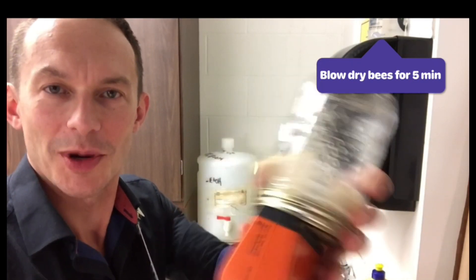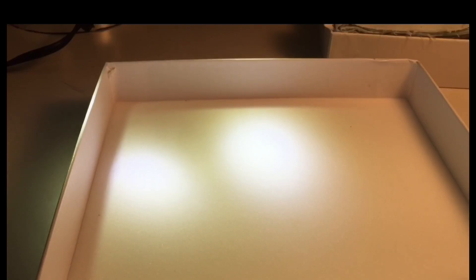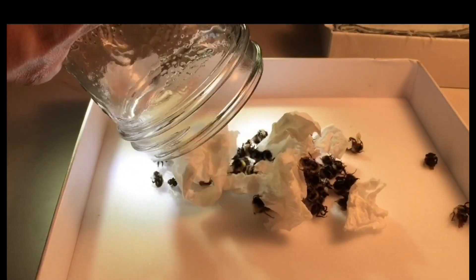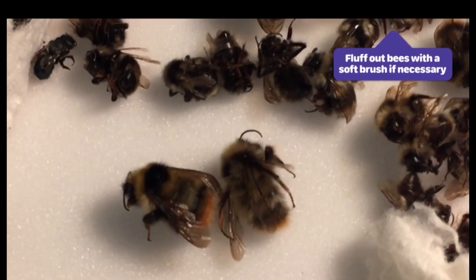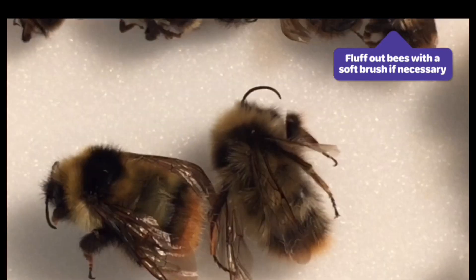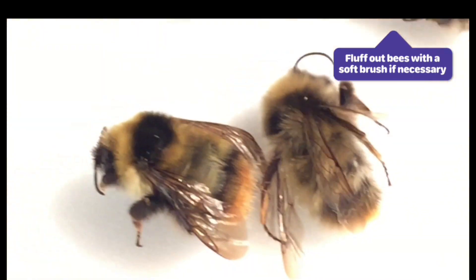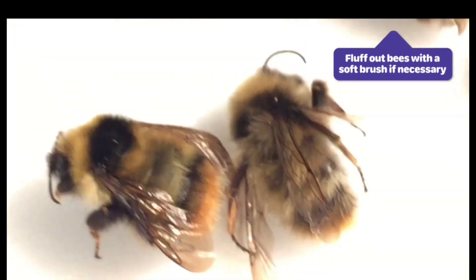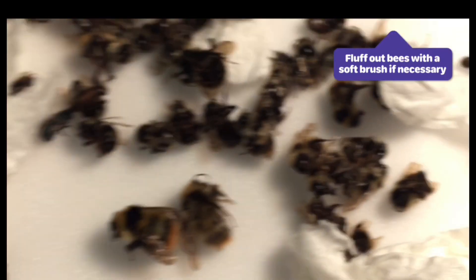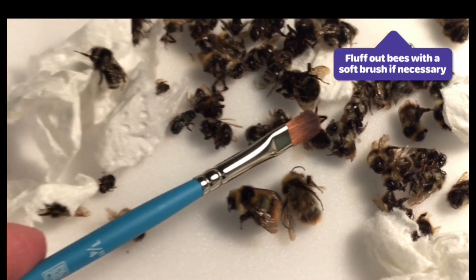First I felt like a bartender, now I feel like a hairdresser! And that's it — now you're an expert at shampooing and blow drying bumble bees. Here we have some beautiful fluffy bees all ready for pinning. You can see that these bees are now very nice and beautifully clean — all the hairs and colors are visible. If you need to fluff them out any more, you can always use a paint brush — this is just an artist's brush.